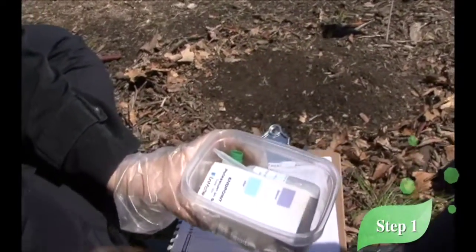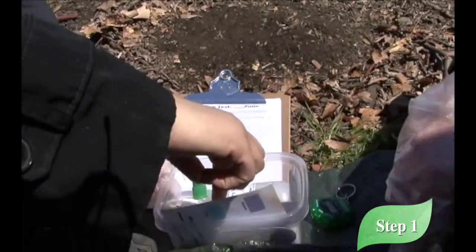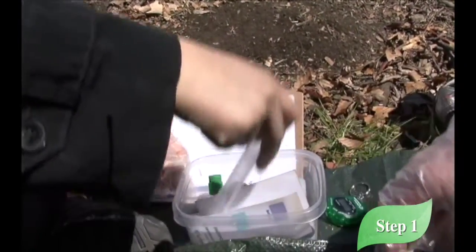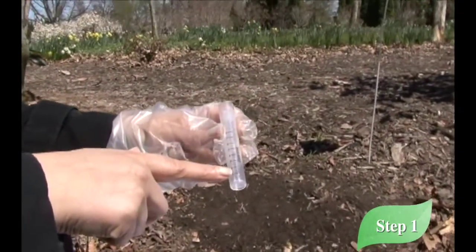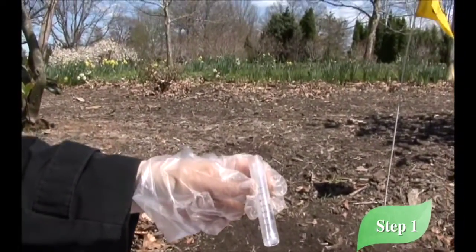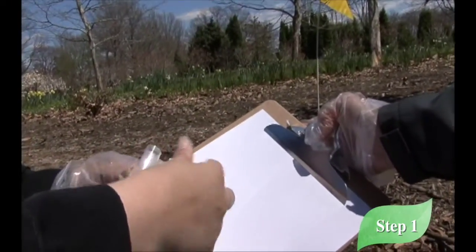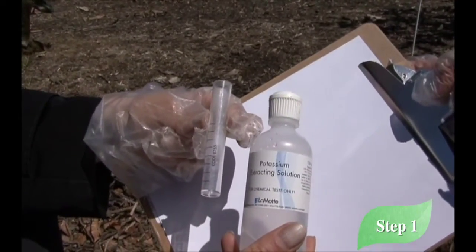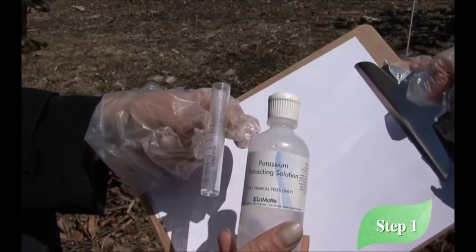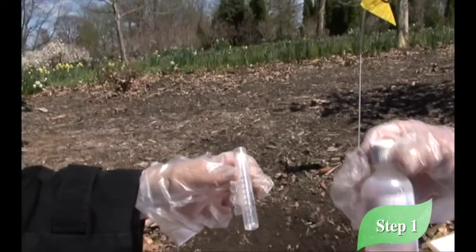In our potassium kit, it says step 1 that we're going to need a test tube, which is right here. And notice that it is graduated. We are going to utilize the potassium extracting solution, and we're going to pour at least 7 milliliters, so we need to go to the 7th line. I'll do that.